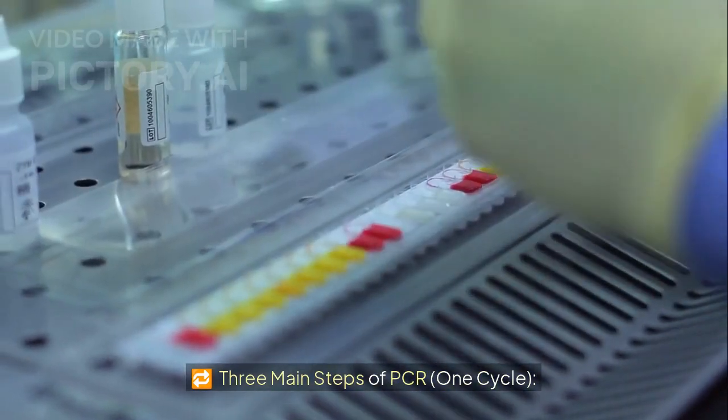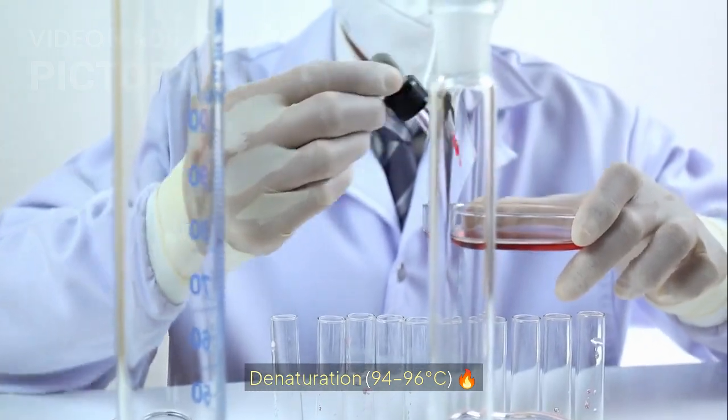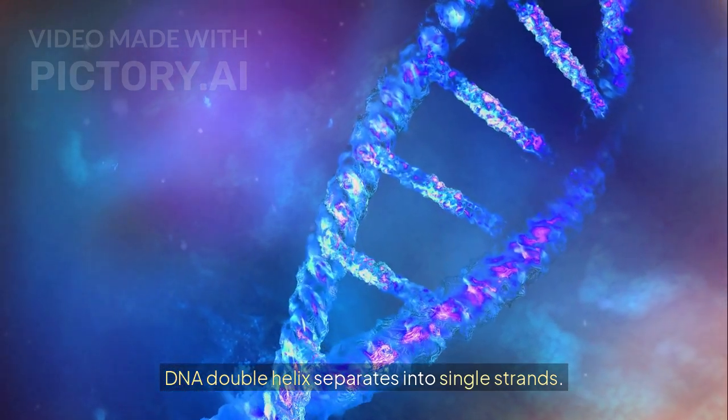3 main steps of PCR. 1 cycle. Denaturation, 94 to 96 degrees Celsius: the DNA double helix separates into single strands.